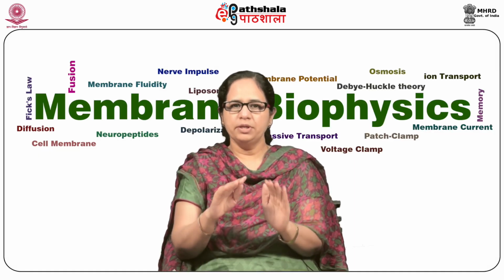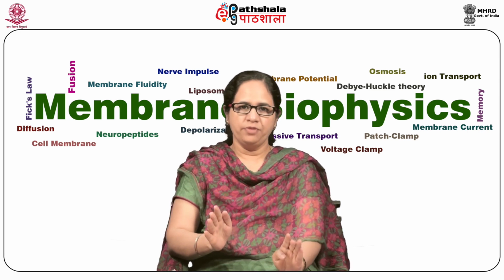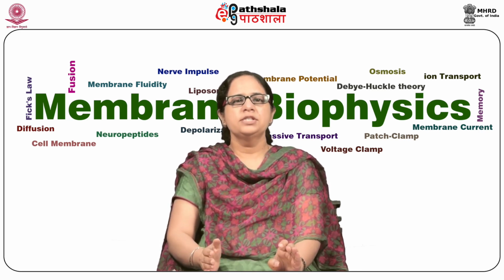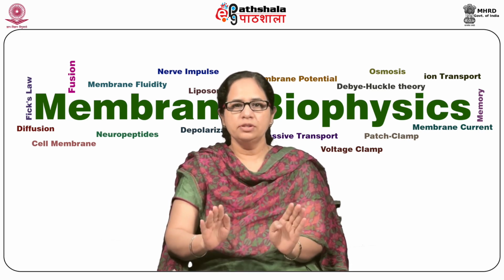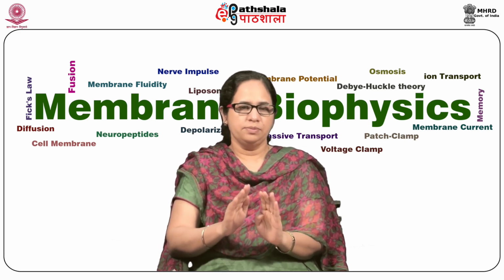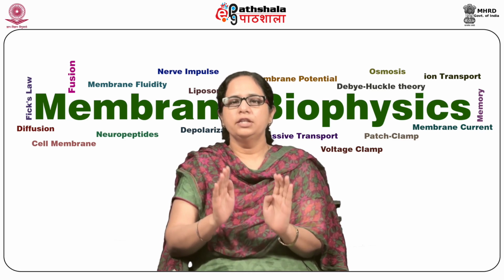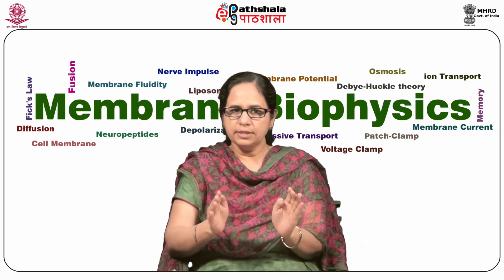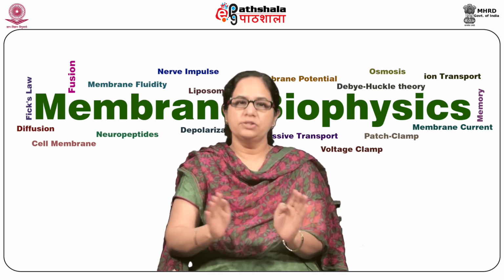Patch electrode fabrication or patch pipette fabrication. For any patch clamp experiment, several steps are essential to make a proper glass pipette, because only if the glass pipette is made nicely can you get a nice recording.